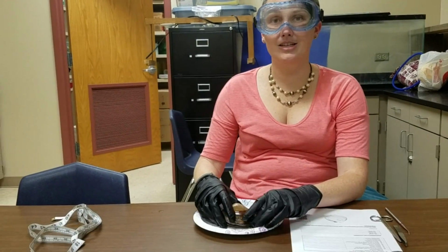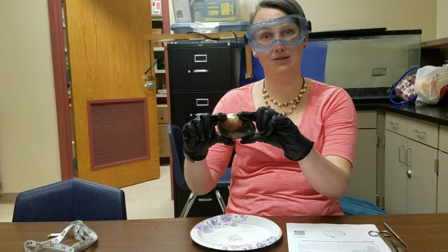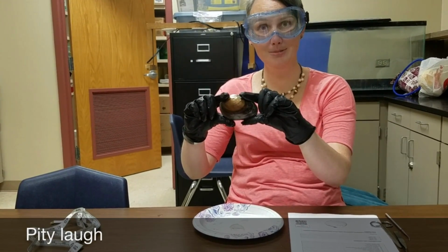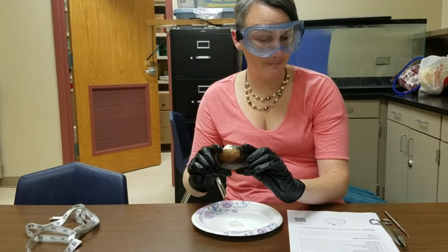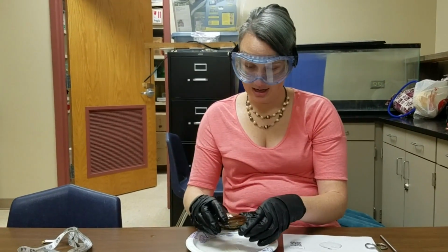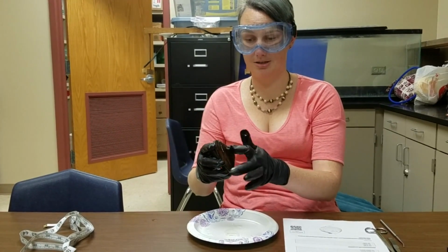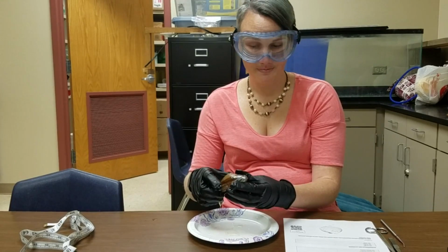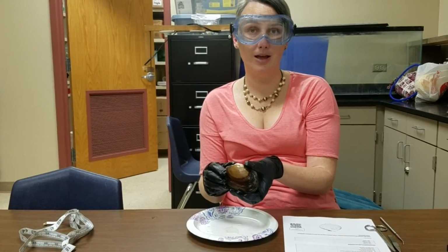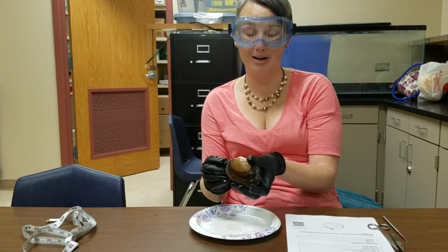Today is your second dissection. We are going to be dissecting a clam, also known as a mussel. I have a massive mussel right here, massive mussels. Everybody's groups are going to get one. You'll notice that they have two hard shells, right? You can feel the hard shells. You're going to be answering your lab sheet as you go, so have somebody filling in all your questions as you progress along your dissection.